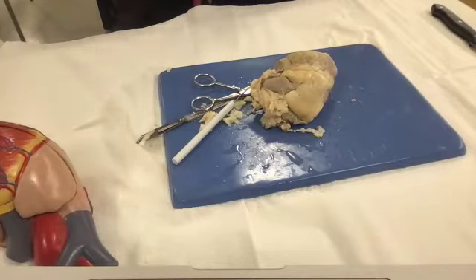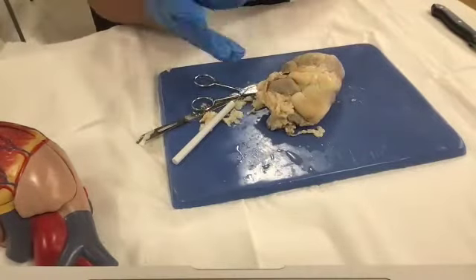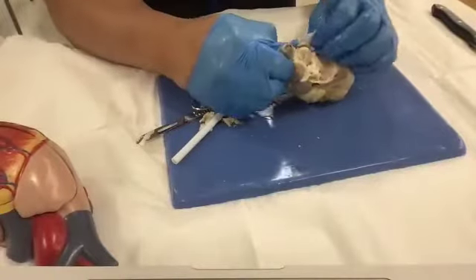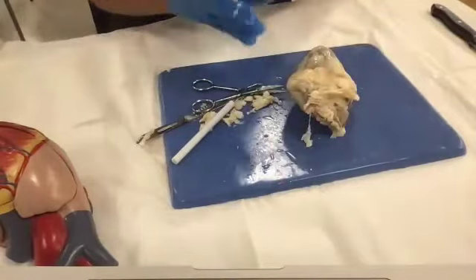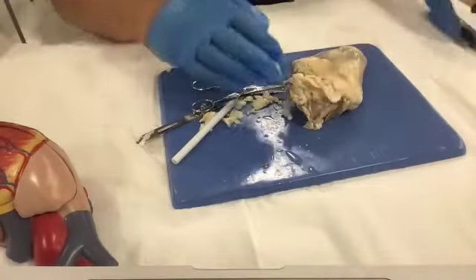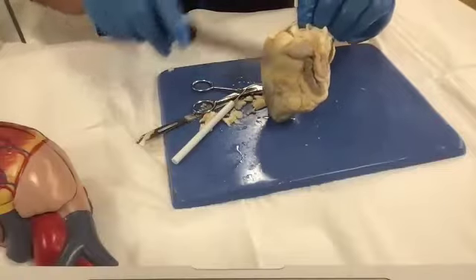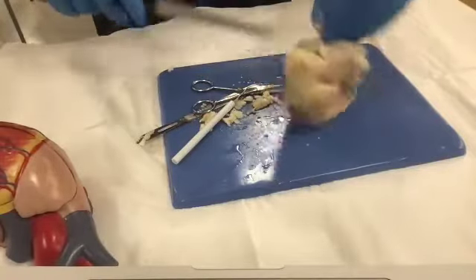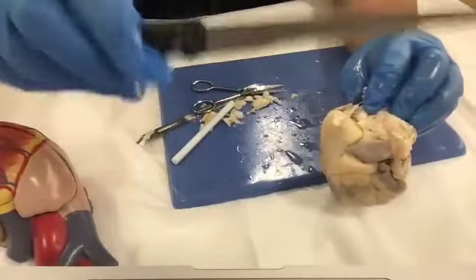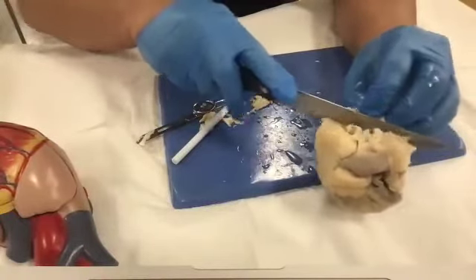Now, I already mentioned the outer layer, which is your pericardium. Okay, that's the tough layer on the outside. And you can see here, I'm really trying to pull it apart. It's not that easy. Now let's look at the inside. Okay. So I'm going to cut this thing in half so that I can expose the anterior portion and then the posterior portion. And I'm using this wonderful surgical tool from the 99-cent store called the knife. I just find it easier if I do it this way.